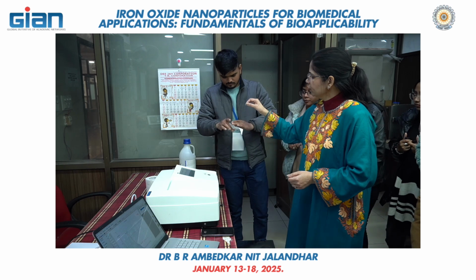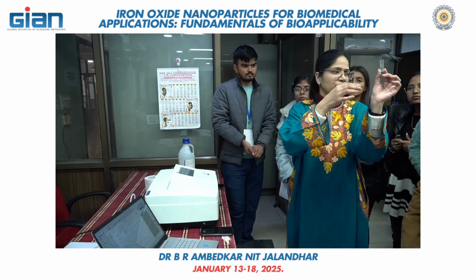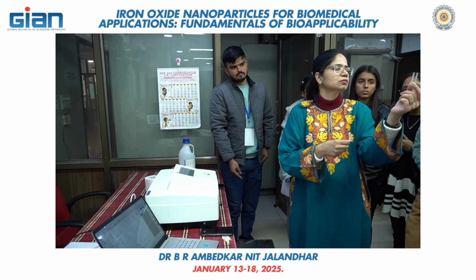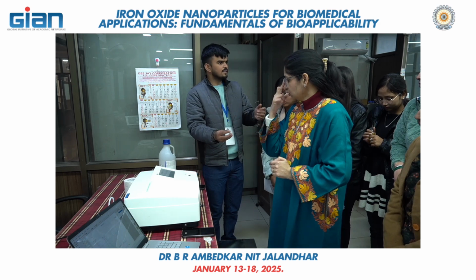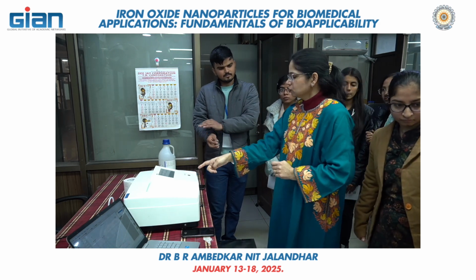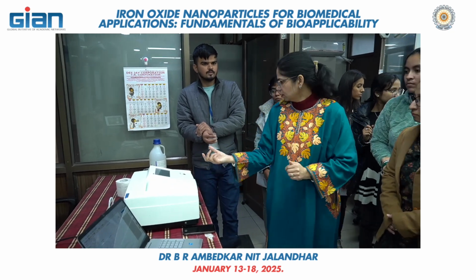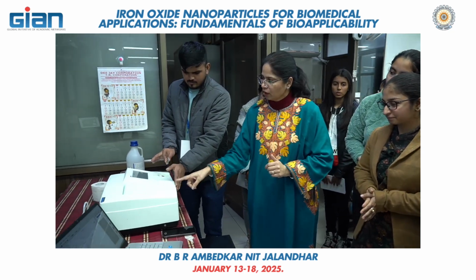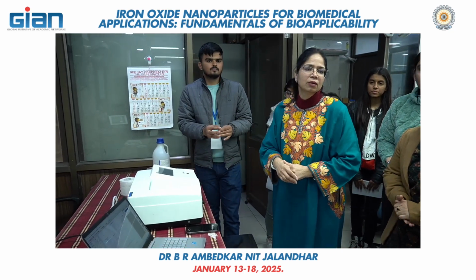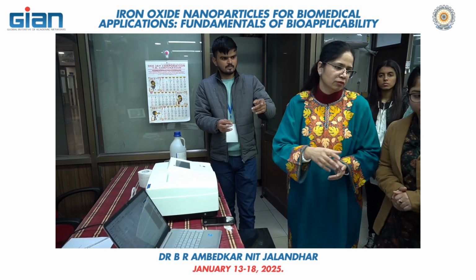So this one is the UV cuvette. You can see this is the UV cuvette. This is okay. So you can put the sample in this. You have the blank sample. Already we have the blank sample, which is containing water. So it is there, and now this is a test sample. So now the gold one.